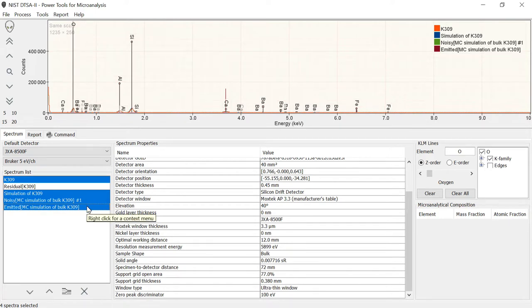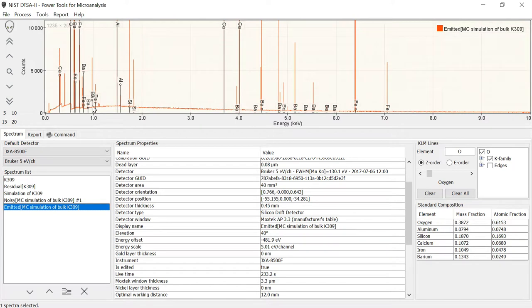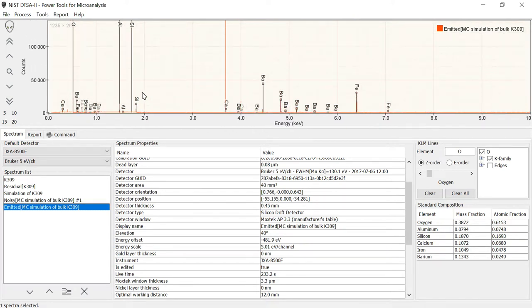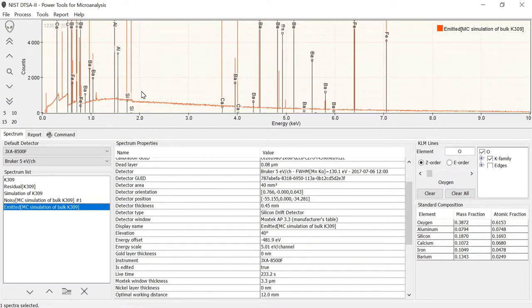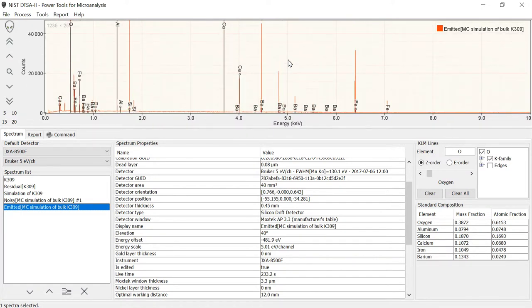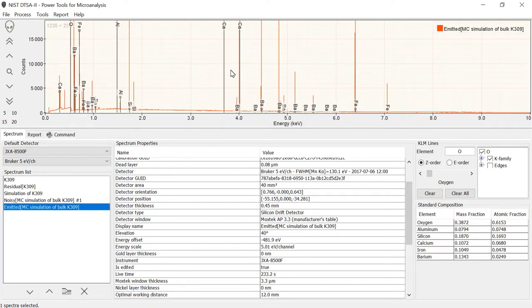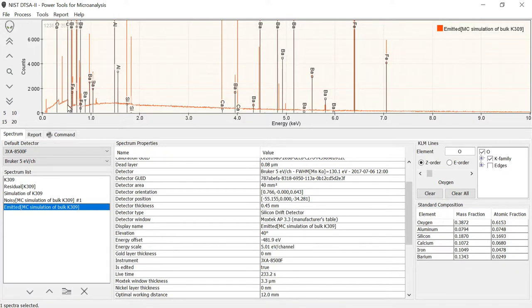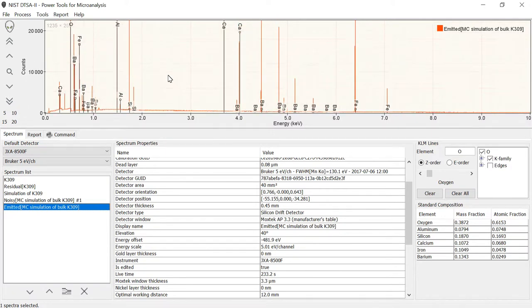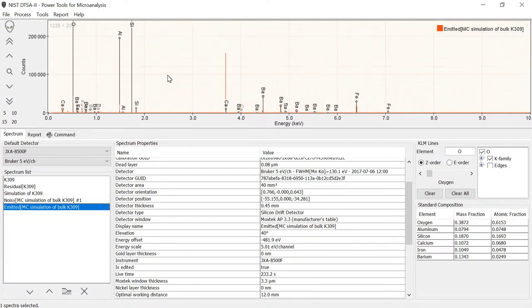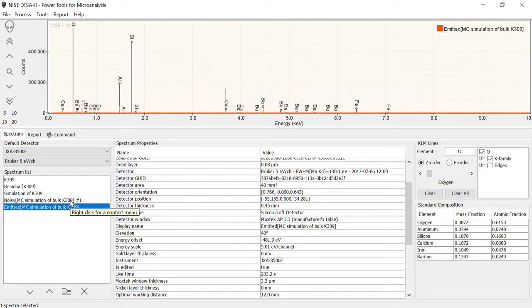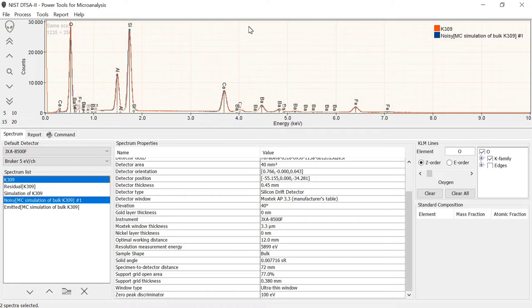And it shows us it's added two additional spectra down here. We have the emitted spectrum that looks like this. The emitted is what we would see if we had essentially a perfect detector. The line widths are very narrow. The width of a particular channel, which in this case is 5eV, and the edges are very sharp. So where there is an absorption edge in the material, the edge is very sharp because we are essentially modeling a perfect detector.